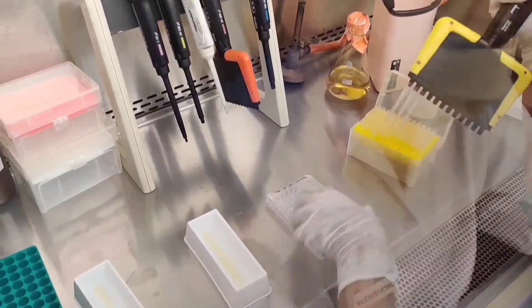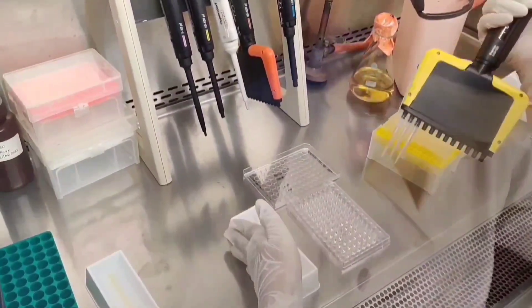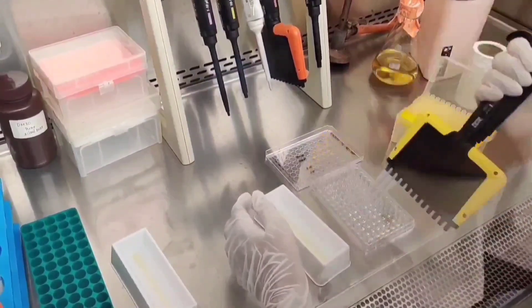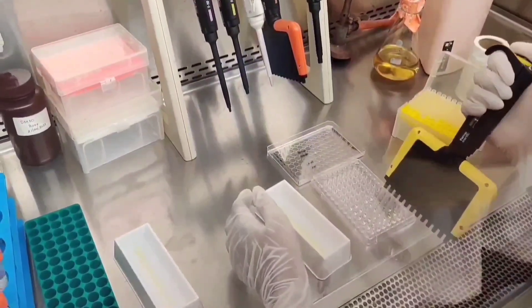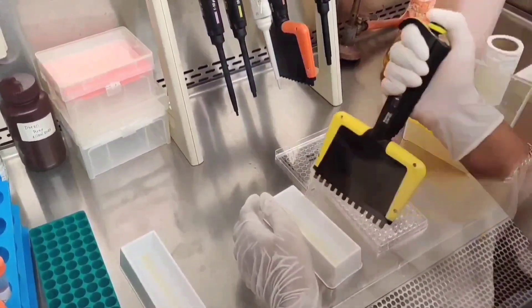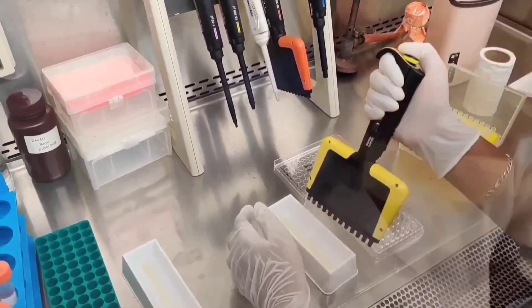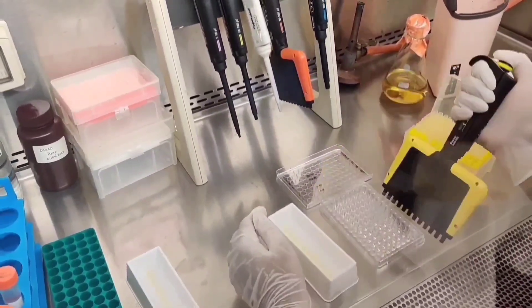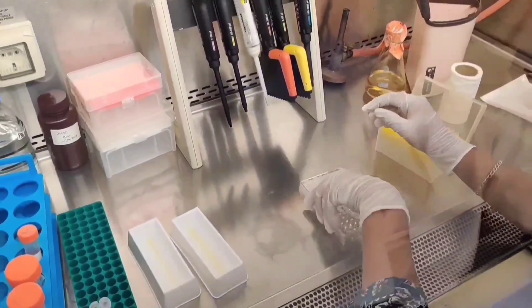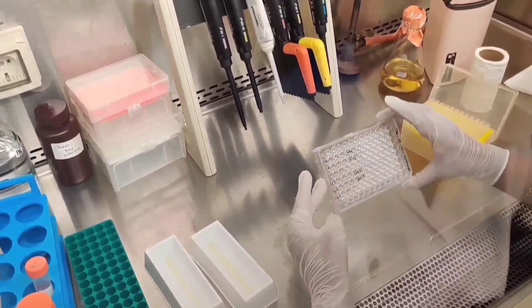Now, 10 microliters of inoculum is added to all the wells. The plate is then incubated for 24 hours at 37 degrees Celsius.